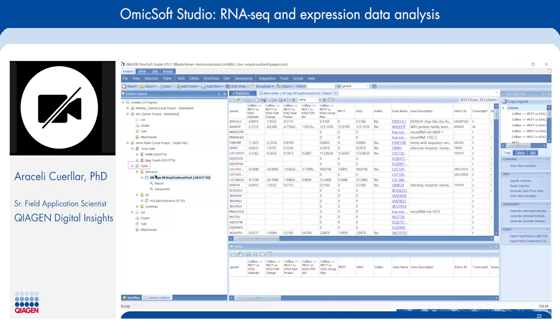And so the differential expression outputs within the inference folder is going to include a report, which represents the table that you're looking at here. And it's also going to generate a visual output, which is going to be the volcano plot.